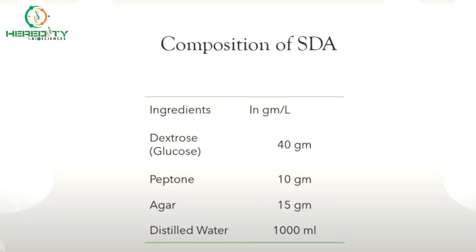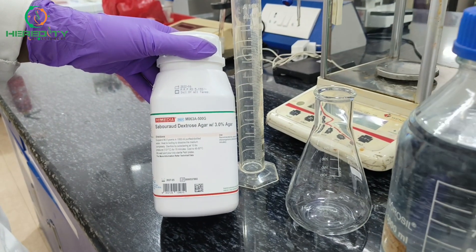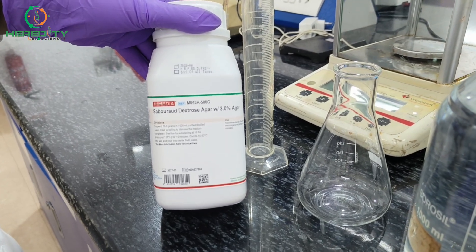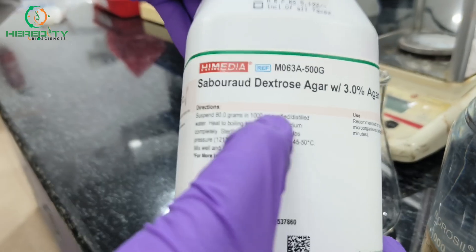Agar is a magical ingredient that solidifies our medium, providing a surface for the growth of fungi. This is the composition for the preparation of SDA media for one liter: dextrose 40 grams, peptone 10 grams, agar 15 grams, and one liter of distilled water. Here I am using the premix of Sabouraud Dextrose Agar from HiMedia, which mentions 80 grams in 1000 ml.